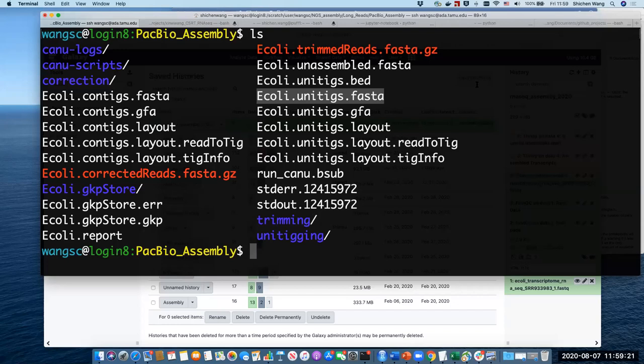So you see, you have a new species you want to assemble, you want to build a reference genome, it's a lot of work. First, de novo assembly is hard. Gene annotation is going to require a lot of data, and it's not that easy. Sometimes it requires manual gene correction, so it takes a really long time. Usually, it's not going to be a single group, a single university, to finish a genome reference. It'll take multiple universities, multiple groups from multiple countries to have a good reference genome finished.